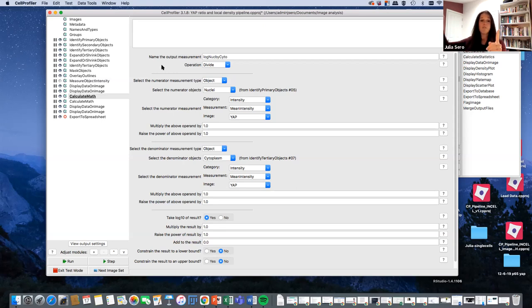So the difference between 1 and 4 is 3, and the difference between 1 and 0.25 is 0.75. So you can see the problem here if we want to do operations on these ratio numbers, like find the standard deviation or find the mean, right? It's always going to skew towards the larger numerator. And it means that if we find means, we're always going to be underestimating the magnitude of the difference when the denominator gets larger. But we can fix this if we use exponents.